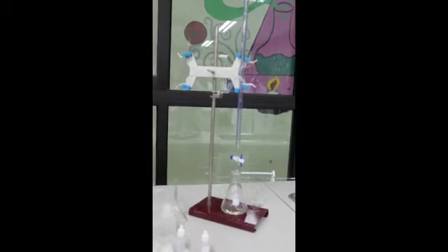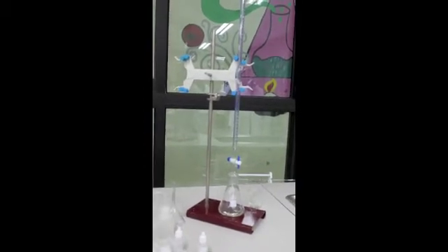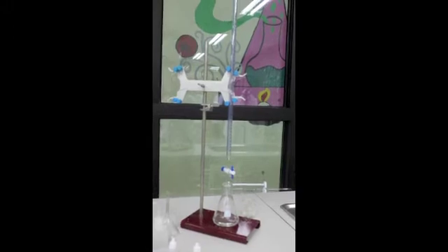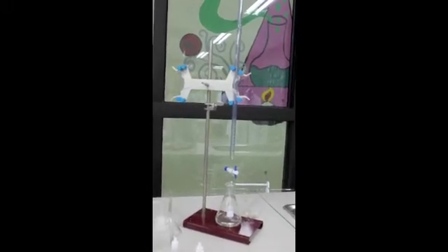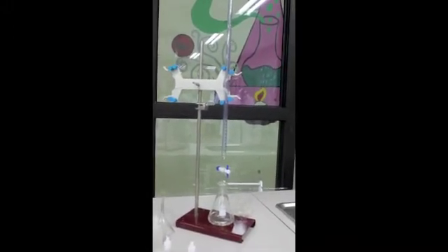Next, rinse the burette with the titrant that will be used in the titration. Let the titrant flow out of the tip, and make sure that there are no bubbles present at the tip and the tip is not leaking. This will ensure accurate results.